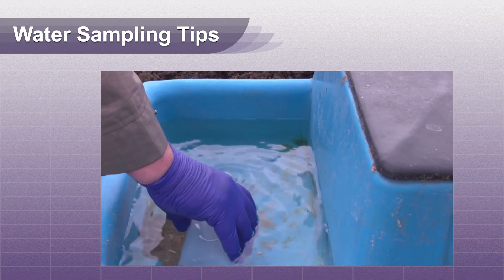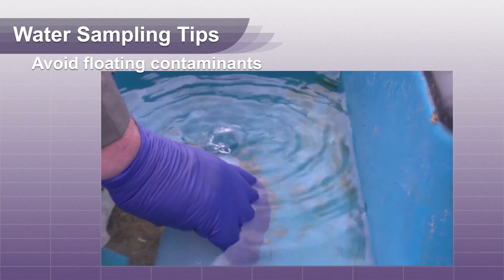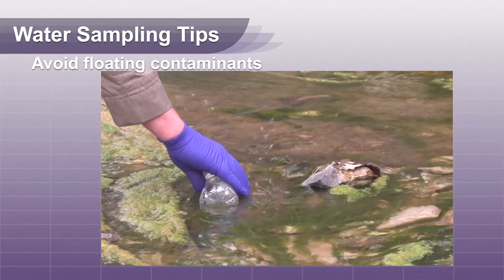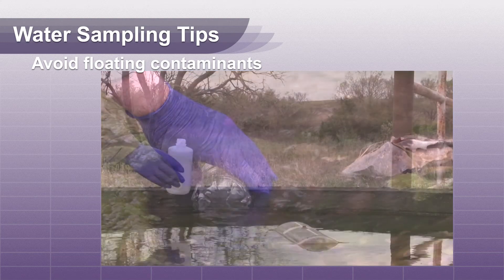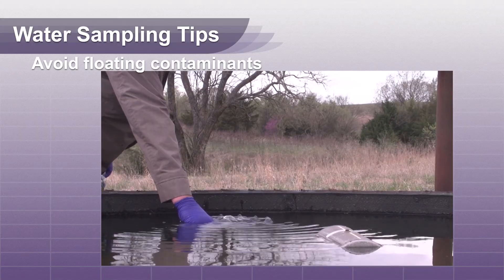When sampling water from an open surface source, do not leave the opening of your container on the surface of the water. This will allow floating contaminants to enter your sample container and alter your results. Submerge the container under the surface three to four inches and allow it to fill.